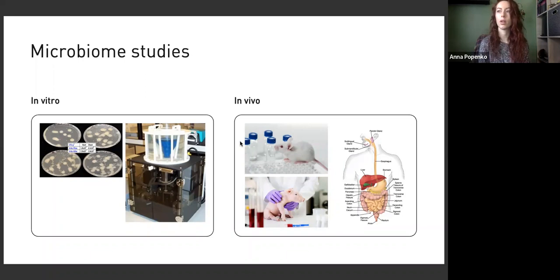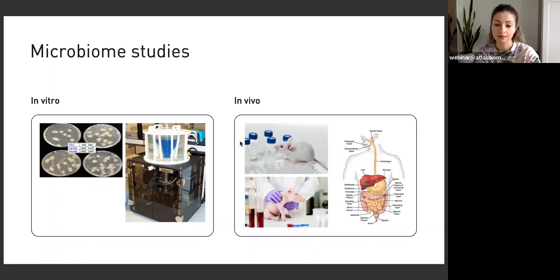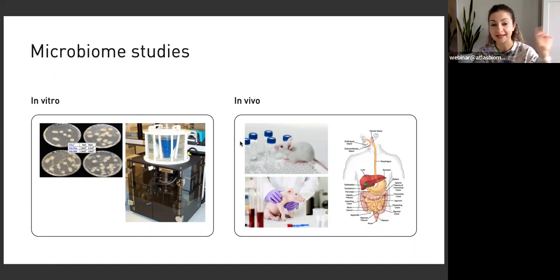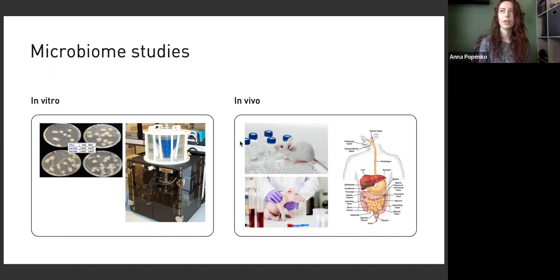Yes, exactly. It is only present in archaea and bacteria. In eukaryotes, including fungi, it is called the 18S RNA gene, but it is different in sequence. So with this sort of technology, we can't detect the 18S, usually. Primers for 18S can be made, and for fungi they usually use not 18S but ITS, some specific fungal regions used for their classification. The problem is making a mix of primers for 16S, 18S and ITS and making this all in just one Eppendorf. We tried to make this, but it didn't really work out.